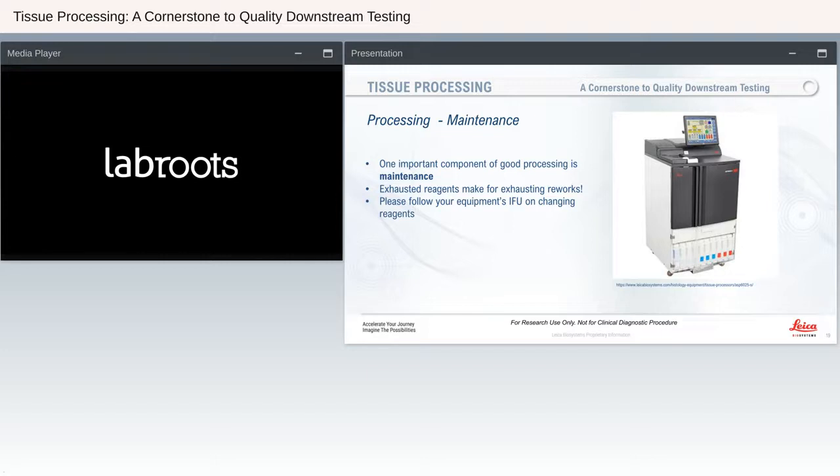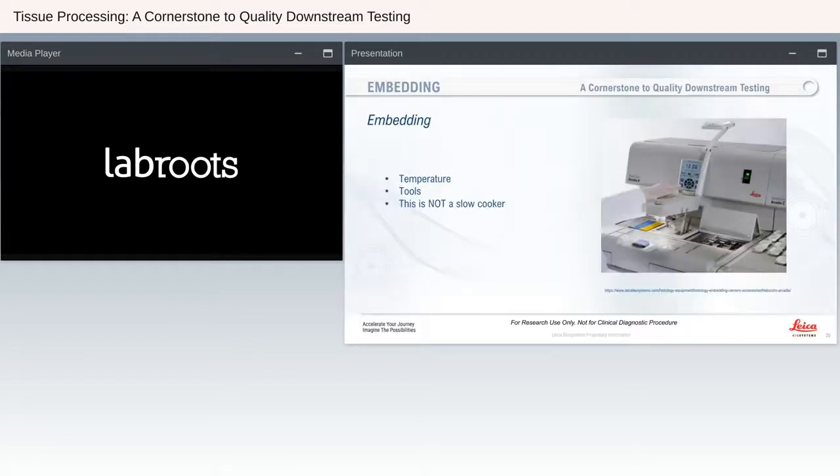That ends the section when we talk about collection of samples, placing them in fixative long enough, making sure the sections are good, and then processing them. We're going to move on to some information about embedding. Embedding is pretty straightforward. There are some tips and tricks that are helpful.